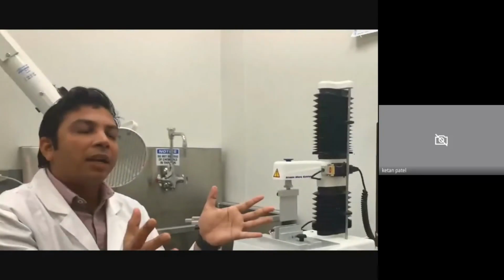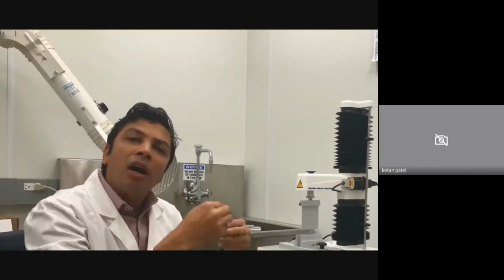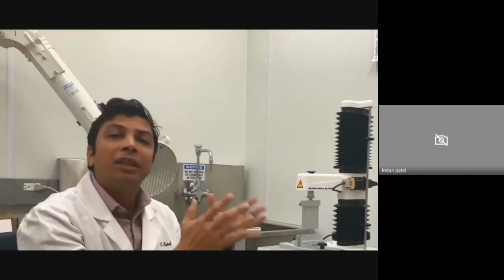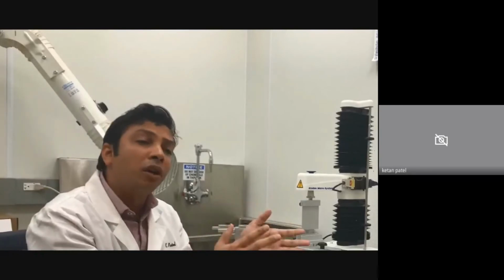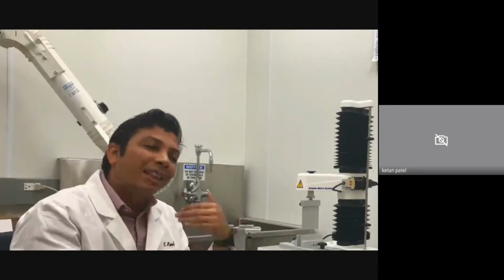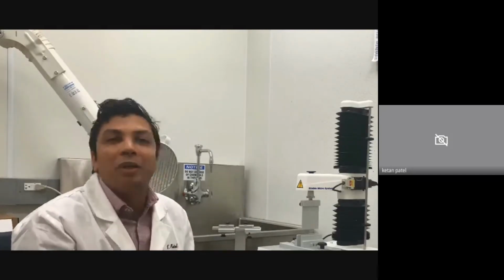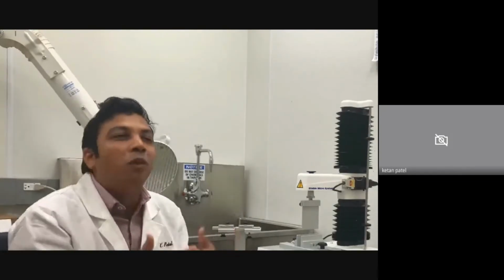So you can, let's say, narrow it down. Let's say you have 100 different combinations, or let's say 10-15 batches. You can definitely narrow it down by using this machine, that this is printable, this is not printable. This drug with this polymer, with this plasticizer may or may not work. So if you have this, good. If you don't have it, then just put it into the machine, and anyway, it's not printable. The machine will tell you that it's breaking, and then it's more of a troubleshooting.